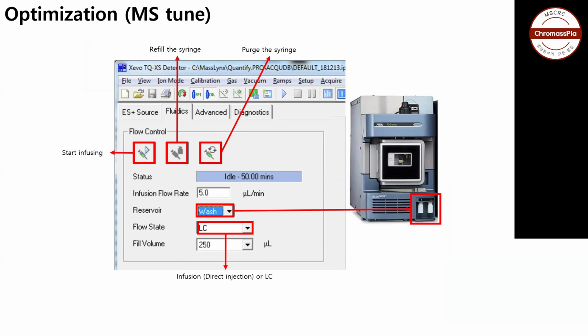But can you explain how small it can be? Let's say we have only one LC vial. So do we need to do it in the LC, then? This is the standard, we can do it with the standard. Is there any case where the standard will be only one LC vial? I understand. If it's standard, it makes sense.